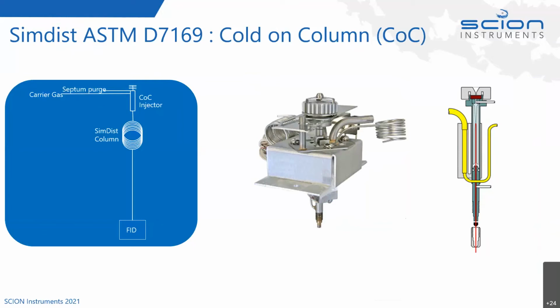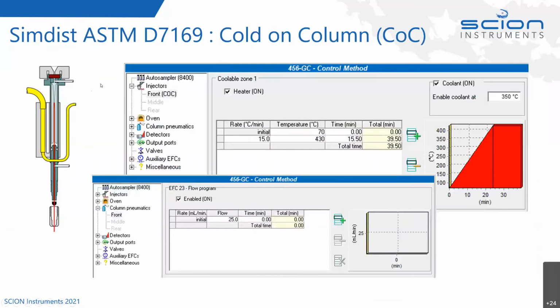So being an on-column injector, the heater on the side is ramped. If I go to the next slide, we'll be able to see the temperature program that's used for the injection. So here are some screenshots from our Compass CDS software that's used to drive the GC.